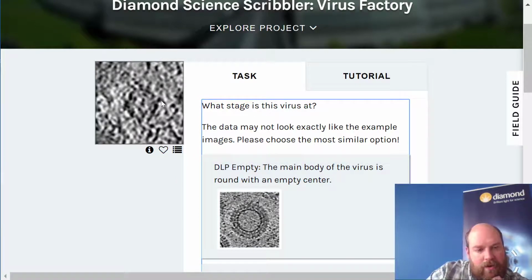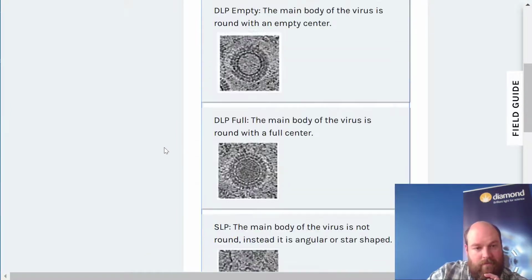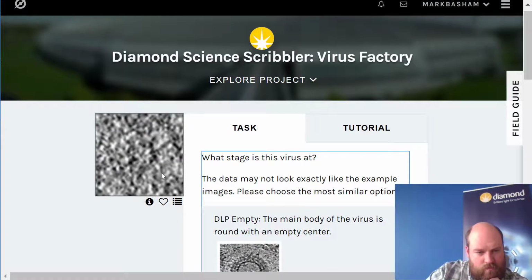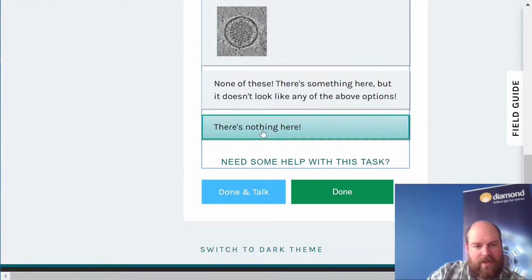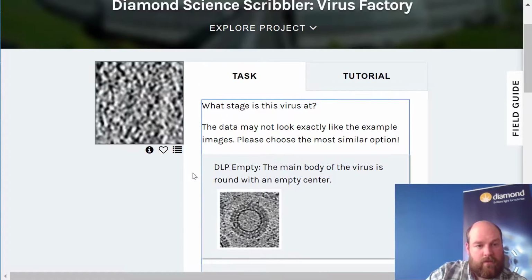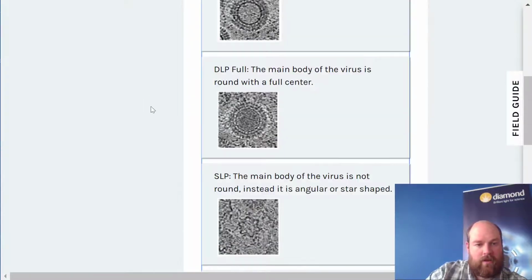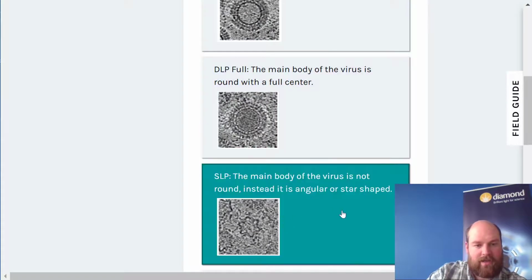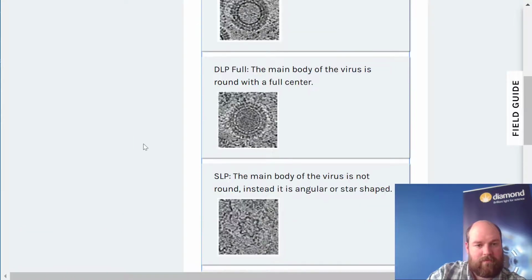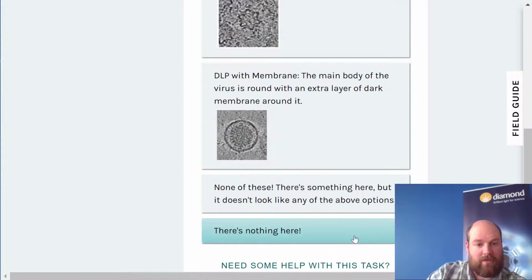In fact, actually, you know what? I'm going to change my mind. I think that's not a virus. Yeah, I can't see anything in that one, so I'm going to say there's nothing here. And I'm going to say there's nothing here too. I was just hoping to find one. Oh, I can just see the edge of a star shape there, so that's probably one of these. Oh, and here we go. This is a nice one. We've got a nice clear outside with an empty middle, so that's got to be the empty middle one.